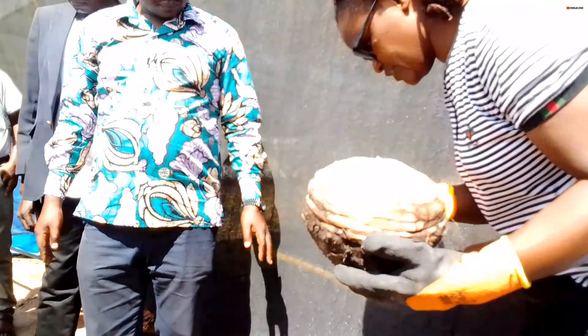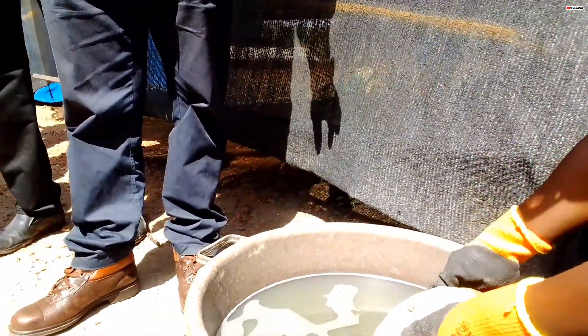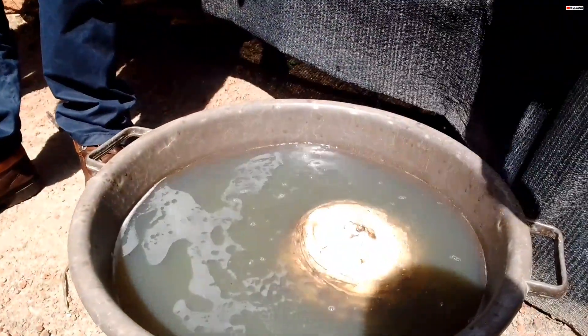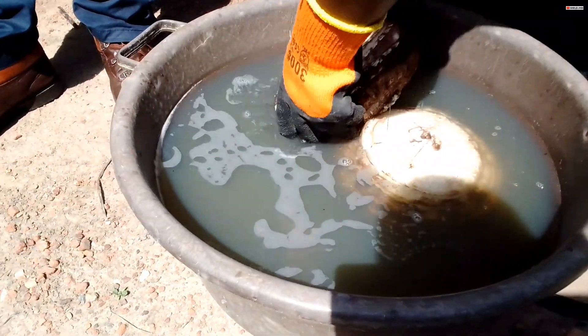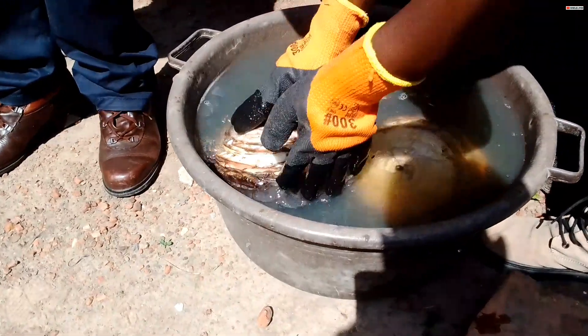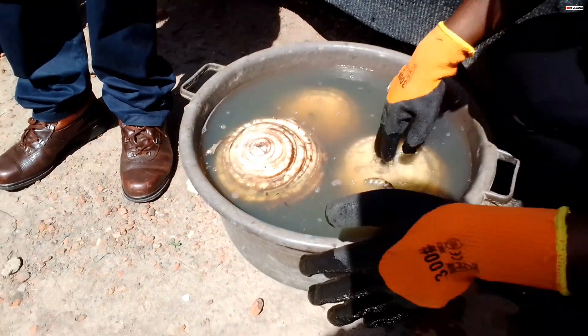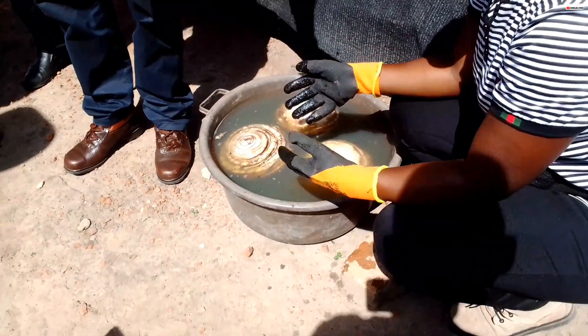So this is where we've mixed our disinfectants. You bring the prepared combs and you dip them. If you are doing it on a commercial, on a big scale, you have a big container that can accommodate. This is for demonstration — we have drums inside there.